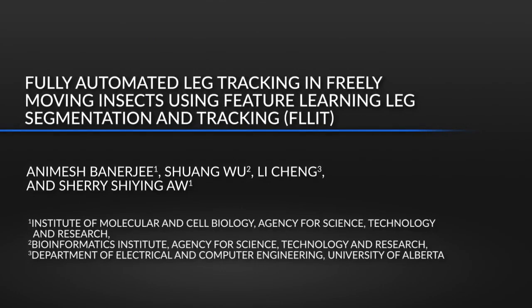FLLIT is an algorithm that calculates the body and leg claw positions of a tracked animal. And this is useful for characterizing the circuitry that underlies both normal and diseased walking behaviors.